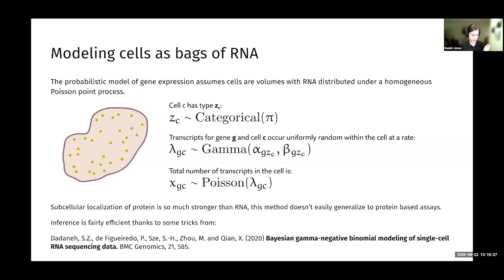So if the cell boundaries make sense for where you observe the RNA molecules, that scores highly and is more likely. But if it doesn't make sense for the observed transcript distribution across space, then it scores poorly. And it's the same idea as with the simulations: if you run it for a lot of iterations, hopefully you come up with something that plausibly explains the data.